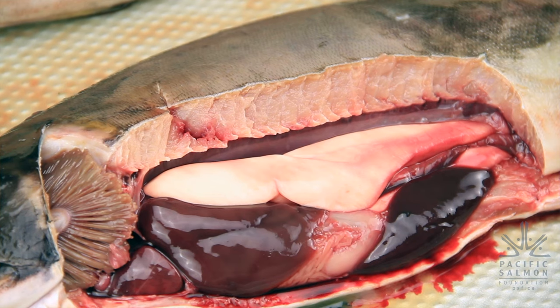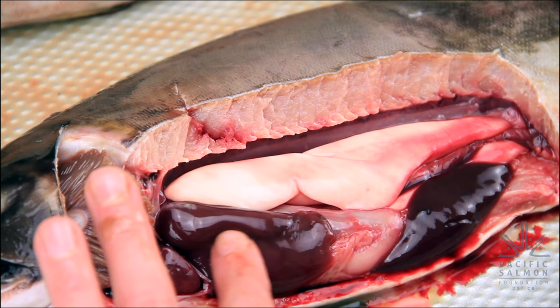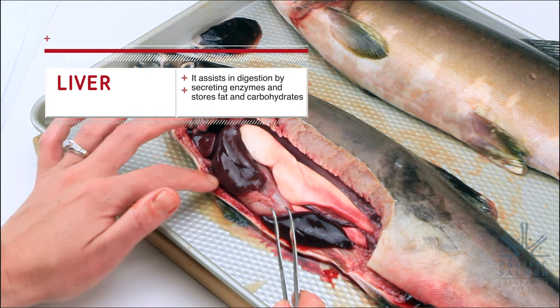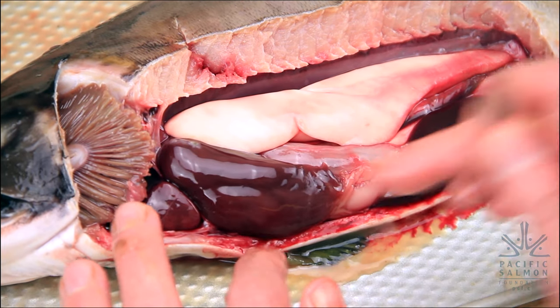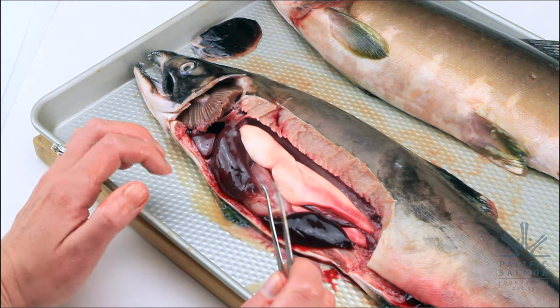Now we can see the insides of our pink salmon. The first thing we'll look at is one of the largest organs in the fish's body — it's really a powerhouse organ. This is the liver. It has a lot of different functions, similar to your liver: it produces bile, helps store energy, detoxifies the blood, and helps with nutrient absorption and hormone production. Find it in your diagram, cut it out, and put it in the correct position in your fish's body.